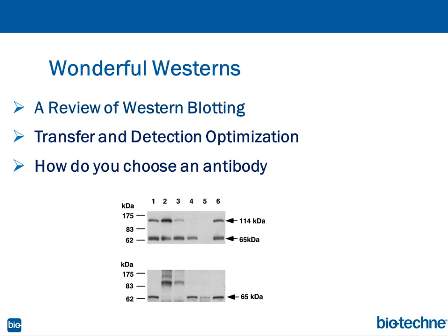So let's optimize transfer first, and then we can follow that with detection. And that's how you really should troubleshoot your blot. Make sure all the protein transferred. So that's basically my opening segment here to kind of get the ball rolling.